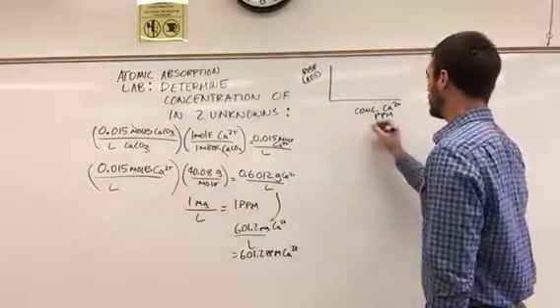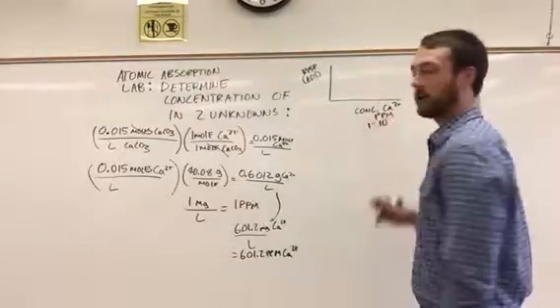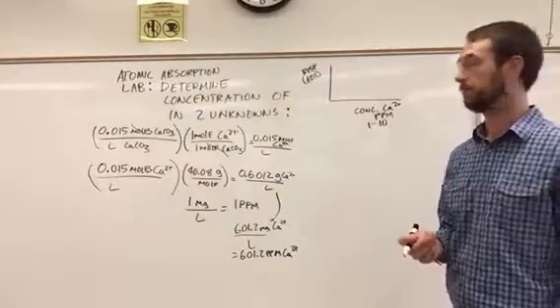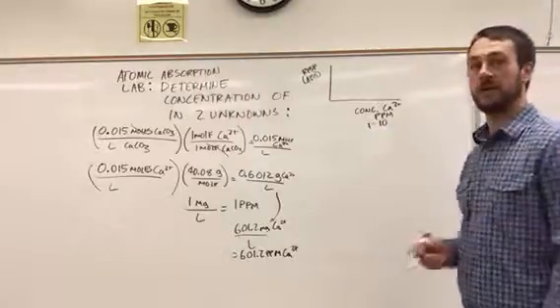And we know that this concentration for calcium needs to be between 1 and 10 parts per million, because that's the best linear range for the instrument, and that's discussed in the lab manual. So you're going to make solutions from 1 to 10 ppm.